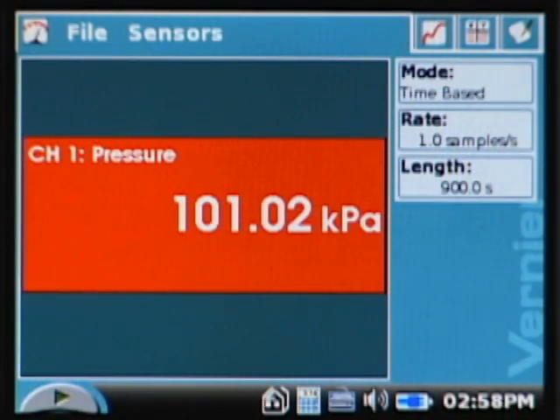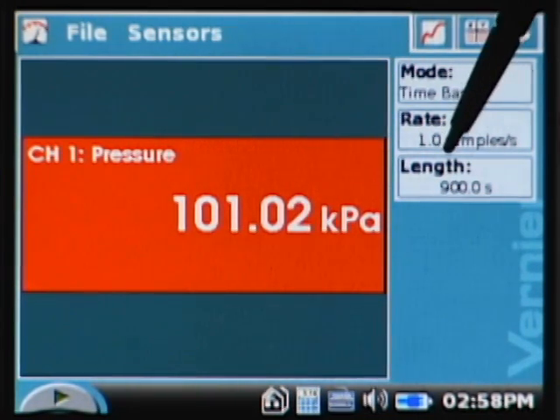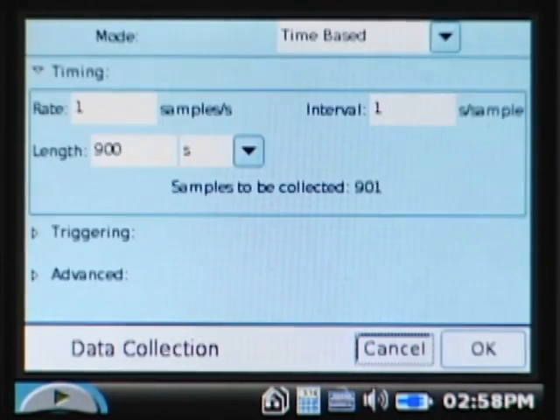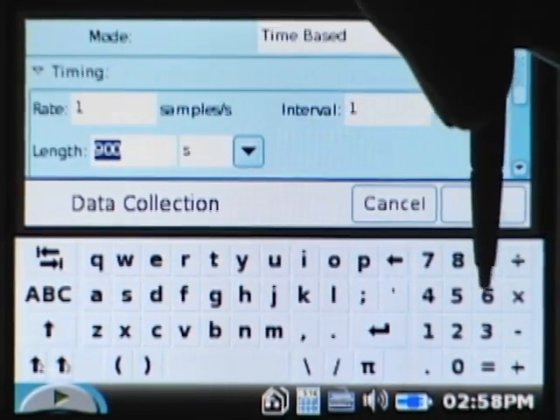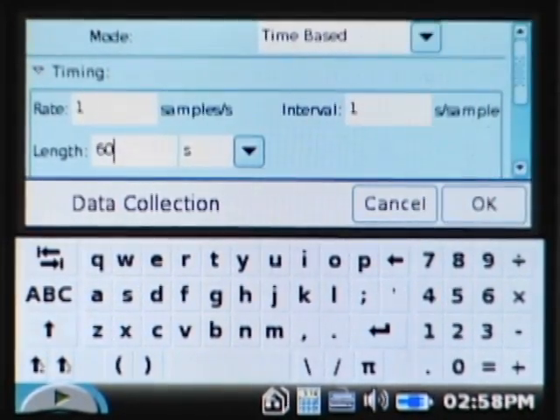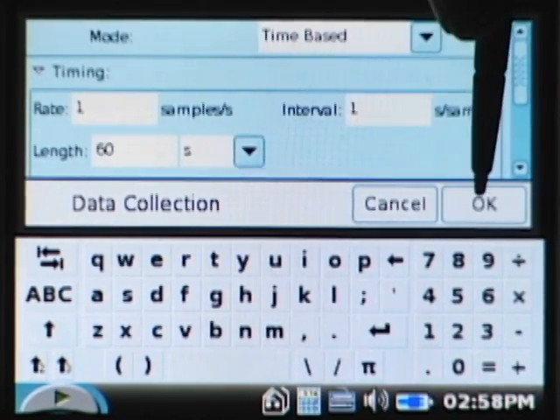It comes up with a default of 900 seconds, and the lab has the students use less time, so we don't need 15 minutes—we just need one minute, so 60 seconds. I need to change that. It's very easy to do. I just tap on the length there, and instead of 900, I make that 60. I'm okay with that.